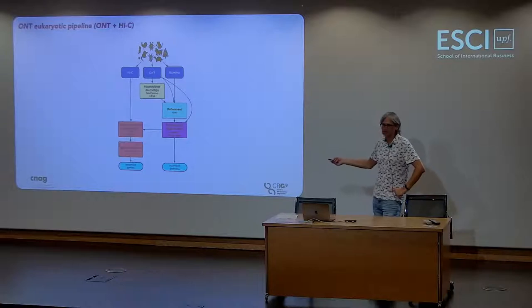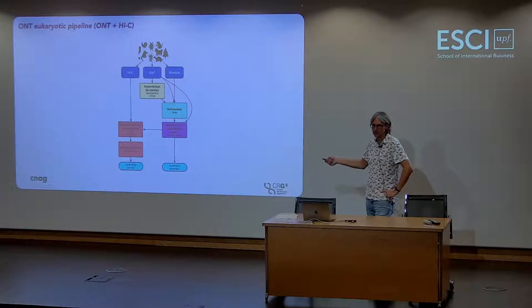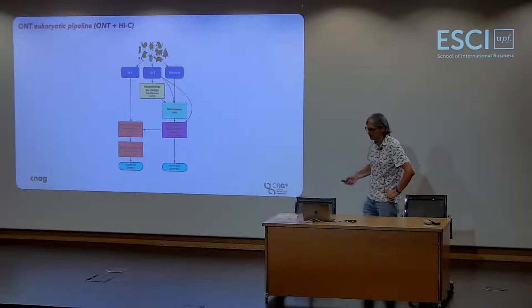This is not necessary with the hi-fi reads. So people using hi-fi, the PacBio reads, they skip the polishing. It's already really good. Okay, and I'll explain why in just a second.